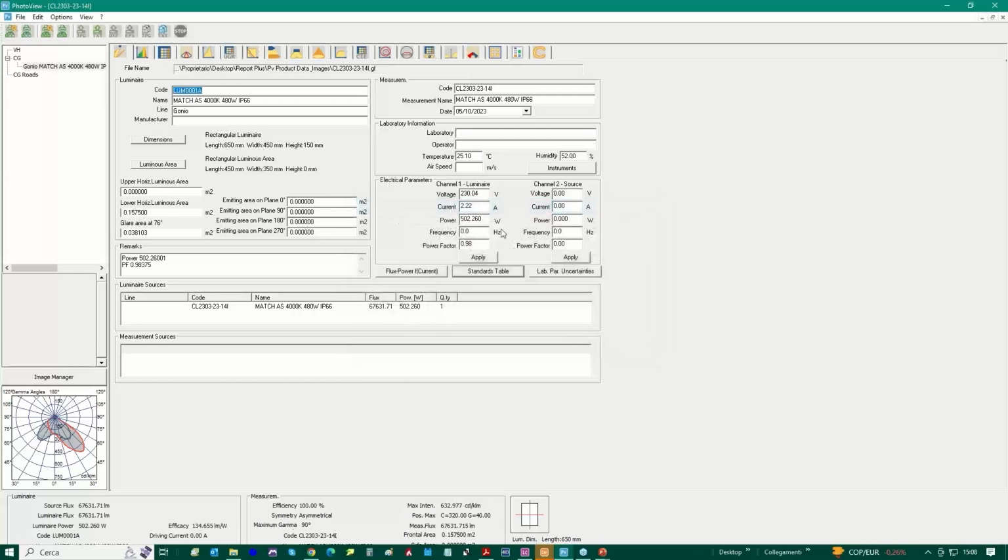This is information that must be printed on the report, because whenever you look at the report, you have to know following which standard the measurement was performed. But that's not all, because a report also comes with images describing the product, describing some particulars, describing the references, and sometimes also images of the instruments. How can we do that?